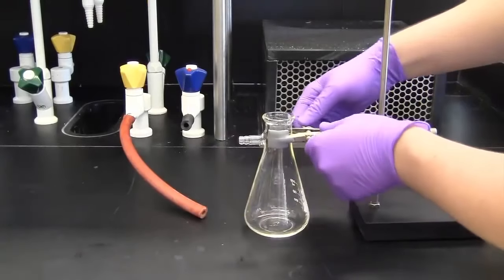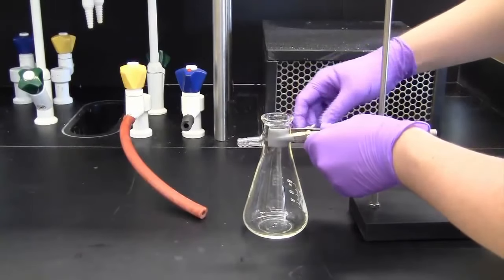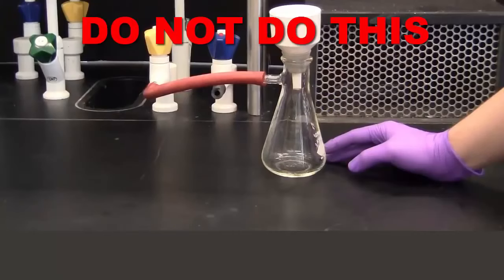First, clamp the flask to a ring stand. This will prevent the vacuum hose from tipping over the filtration setup.